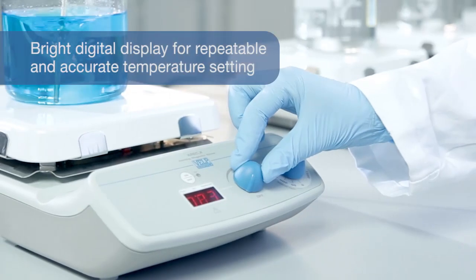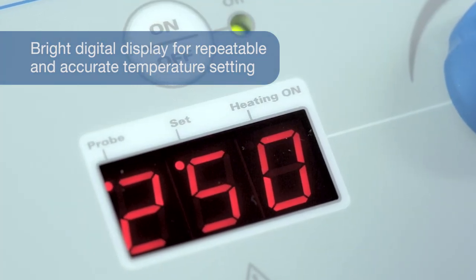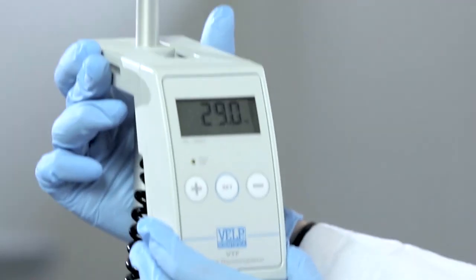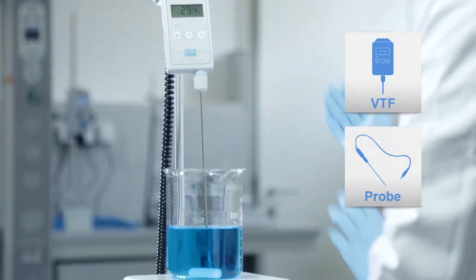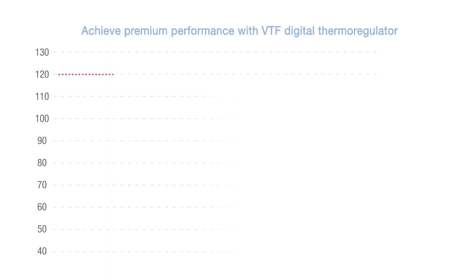Advanced materials, remarkably precise build and the digital display distinguish this product. Combine Aerex X with an external probe or the VTF digital thermoregulator to achieve absolute control of the liquid temperature.